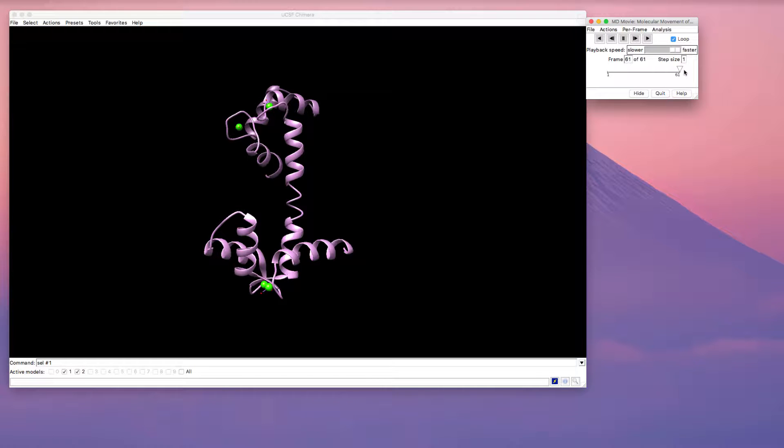So in my previous video I showed you how to merge one structure into another to show a conformational change. In this video I'm going to show you how to manipulate the colors and make the ribbon diagram look pretty.